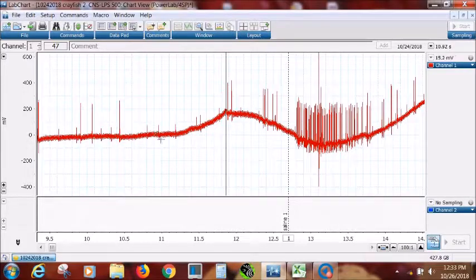And you see there's some 60 cycle noise a little bit, but these are spikes right here, and these are bigger spikes. You get different size spikes because there's different size axons in your extracellular recording. The larger axons give rise to larger spikes, the smaller axons, smaller spikes.